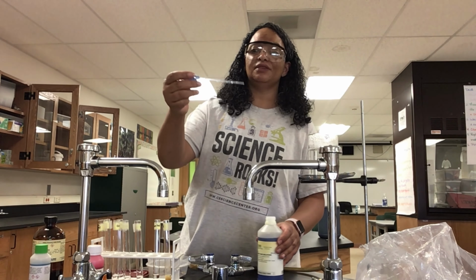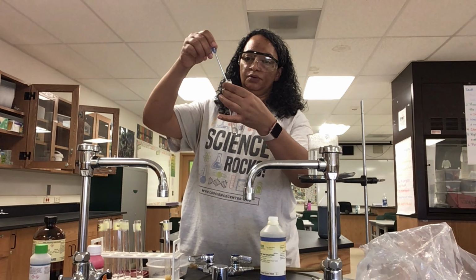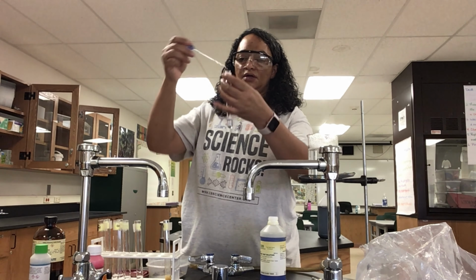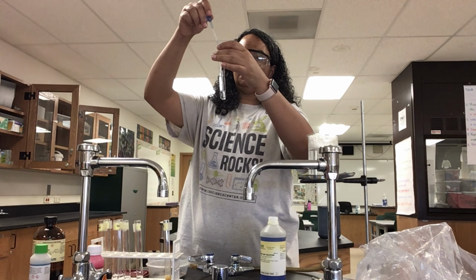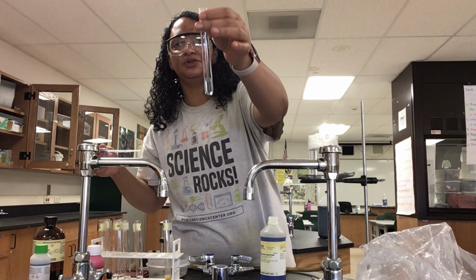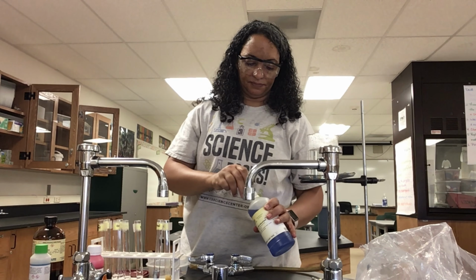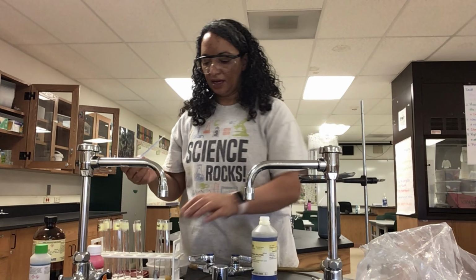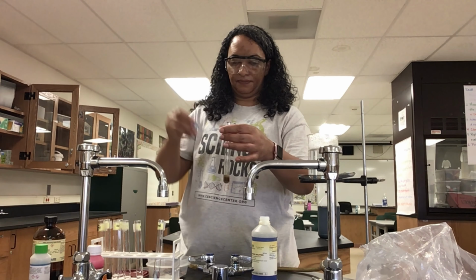Now it's a nice light blue color, so I'm going to put 10 drops or so in my control tube. And you're not going to really see much of a change in color. Let's see if we can get a little more of a change. So it's kind of light blue, it's hard to tell. All right, let me get a little more here. And then I'm going to go ahead and put it into my seed.